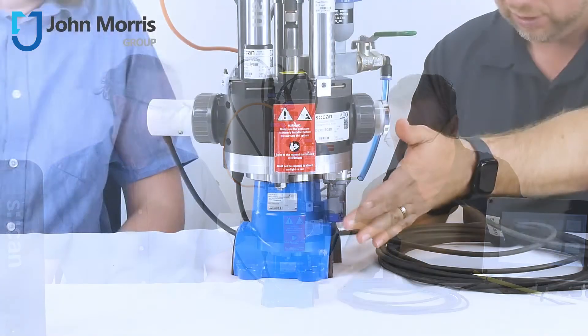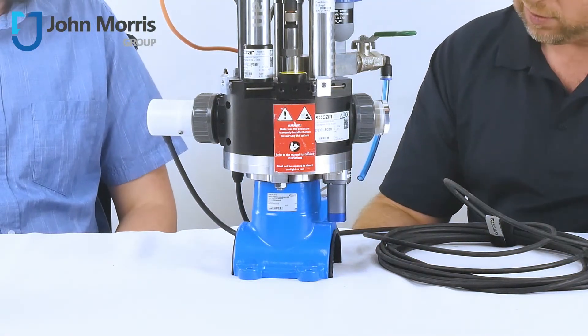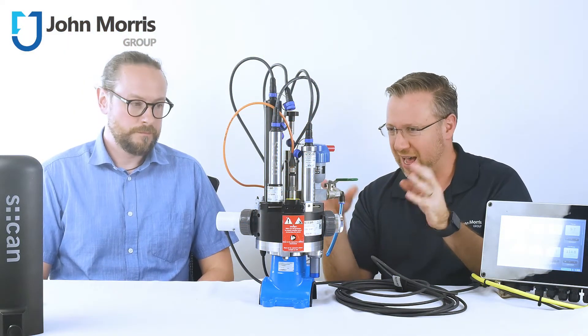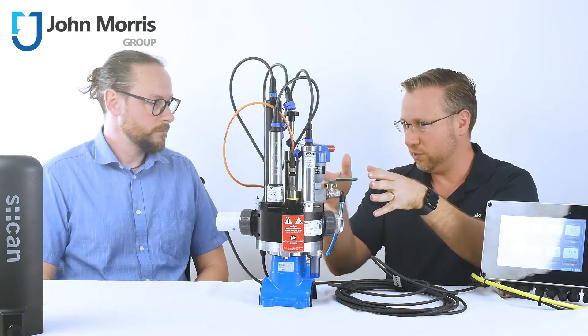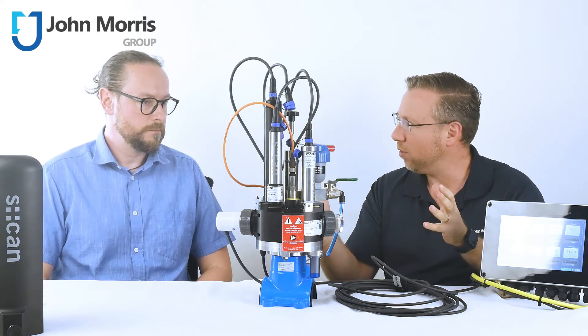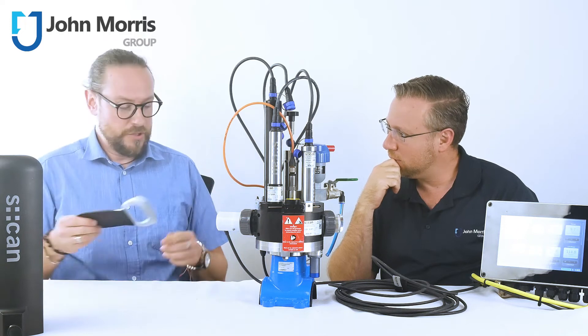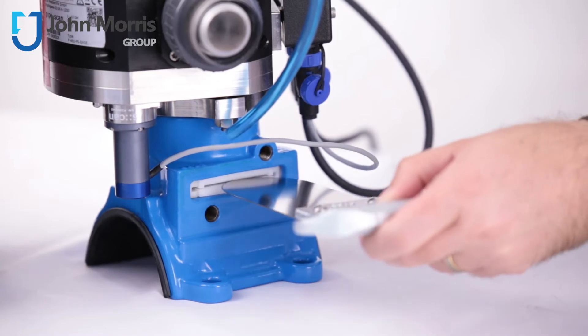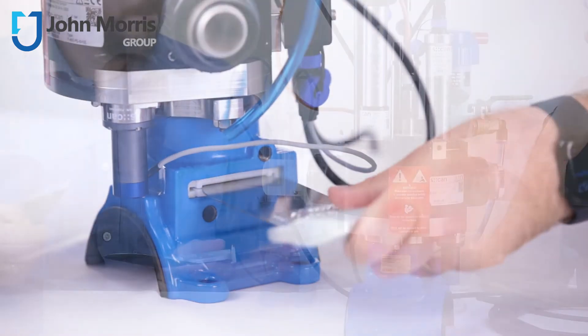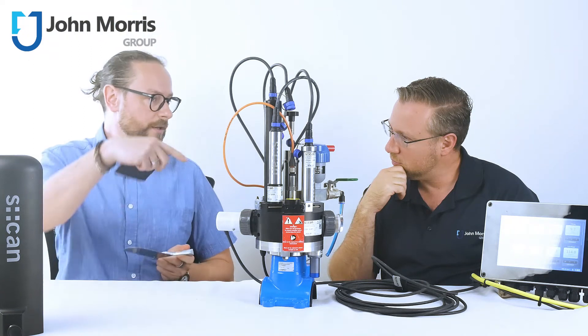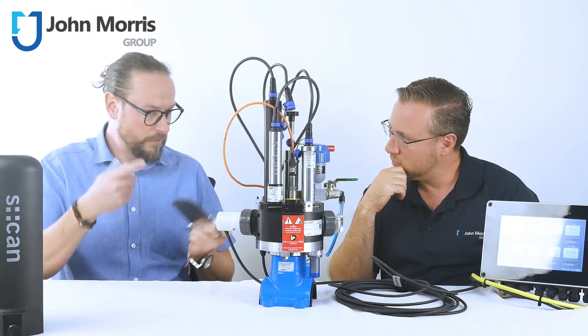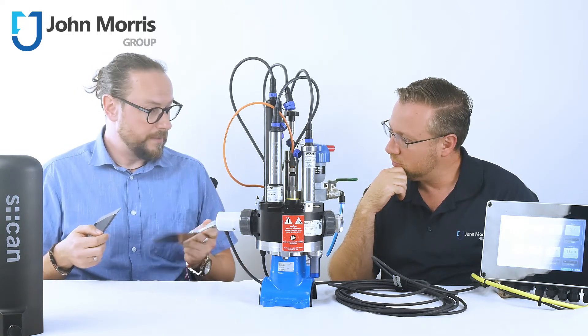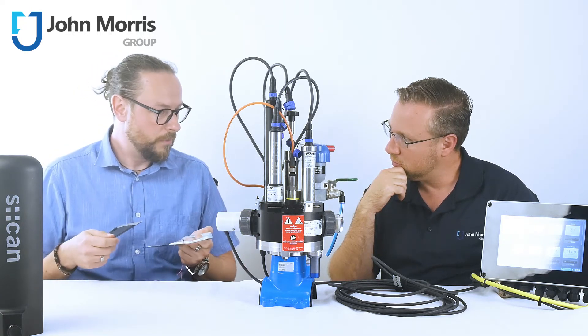Right, and so that's this little beast here, is it? Yes. Right. I see. And so normally the pipe would be under pressure. So how do you service this without having to turn off your water network? Yeah, so therefore we have a special tool. It's some kind of plate and you actually put it between the measuring unit and the clamp saddle. And so separate these two parts and then you can change all the electrodes or you can change cable or whatever you need. And then you remove this blade again and then you are online again.